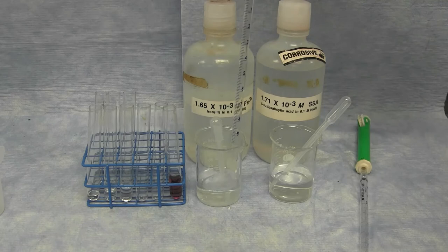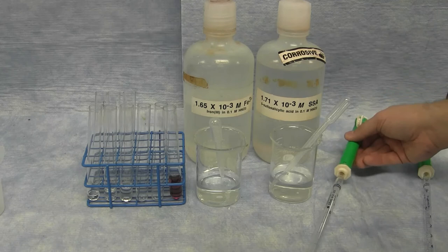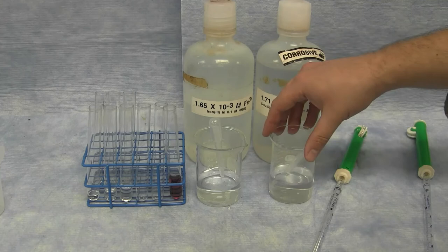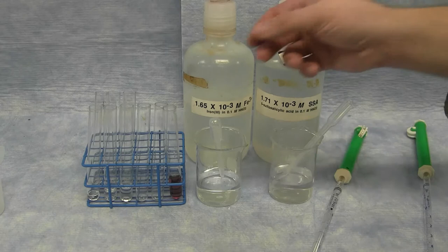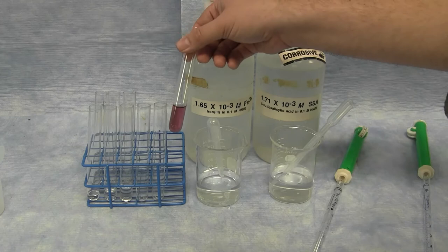Likewise, I can add the sulfosalicylic acid. It is best to use a separate pipette to avoid any contamination between your two solutions. The concentrations of the two solutions are very low, and yet the color can be very intense. So any stray contamination could generate some of this colored product.